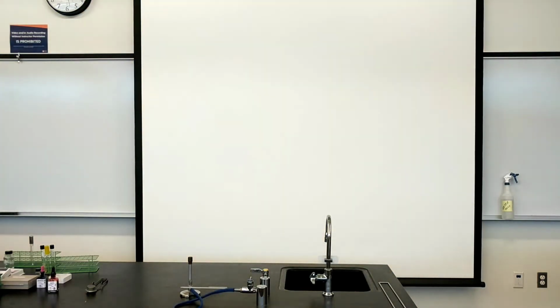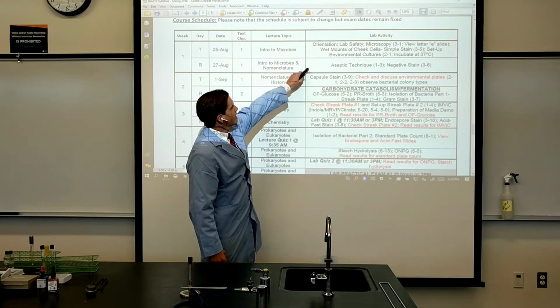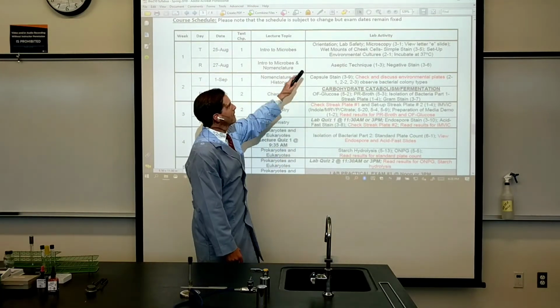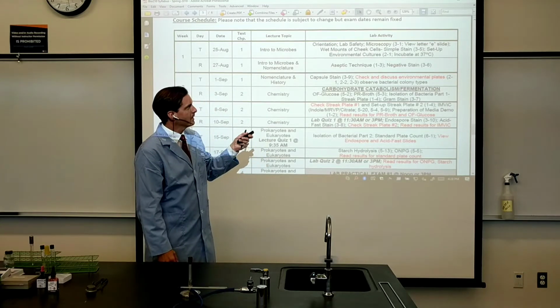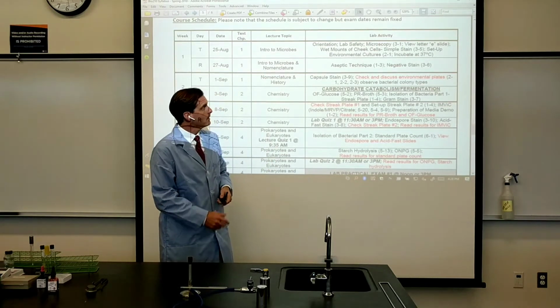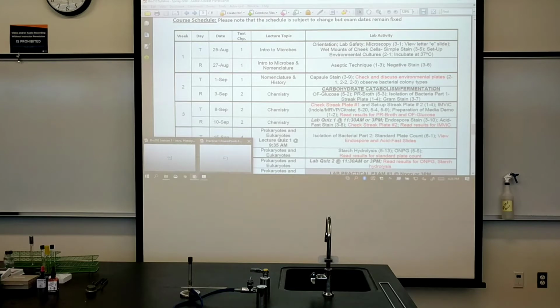I just want to remind everyone, as well as myself, about what it is we need to cover through day 2. So we're going to go back and make sure that we're complete on all of the subjects and reviewing the readouts of the setups from the subjects on day 1. And then we'll finish day 2 with aseptic technique and finally the negative stain. So those are the items that we need to take care of today. They're on our agenda.